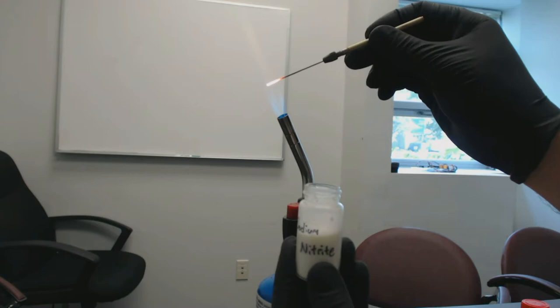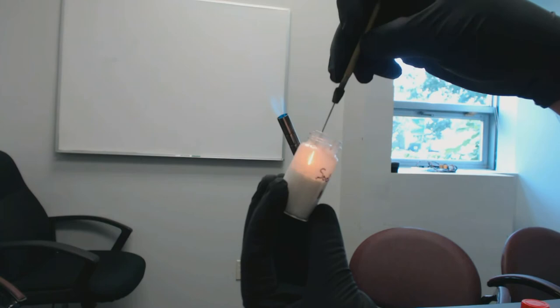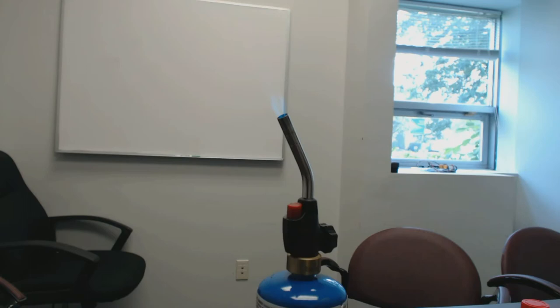Then we are going to quickly transfer that needle into the sodium nitrite. You can see here the reaction taking place — it's an exothermic reaction, which causes the needle to heat up. And now we have a new point on our needle.